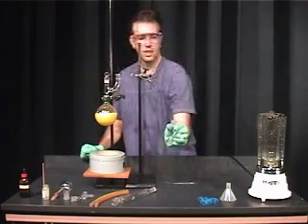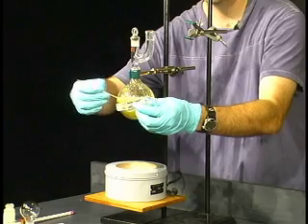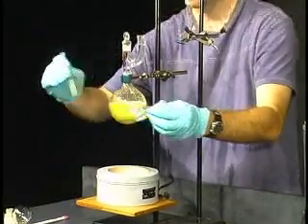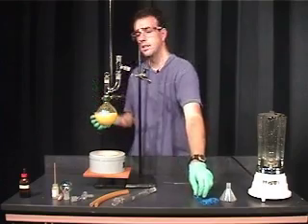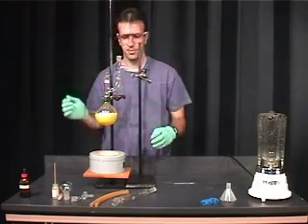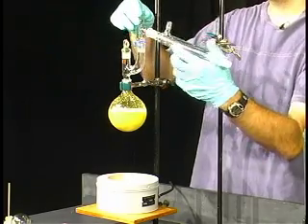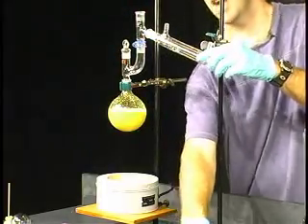The next piece of glassware is your sidearm adapter. I'm going to grease both of these joints at the same time. Put this in and spin it around. Because we're raising this a little bit higher, I'm going to secure this joint using a Keck clip — a joint clip. The joint is already greased, so I'm going to add the water jacket condenser on and spin that around to create a seal, and add a joint clip.